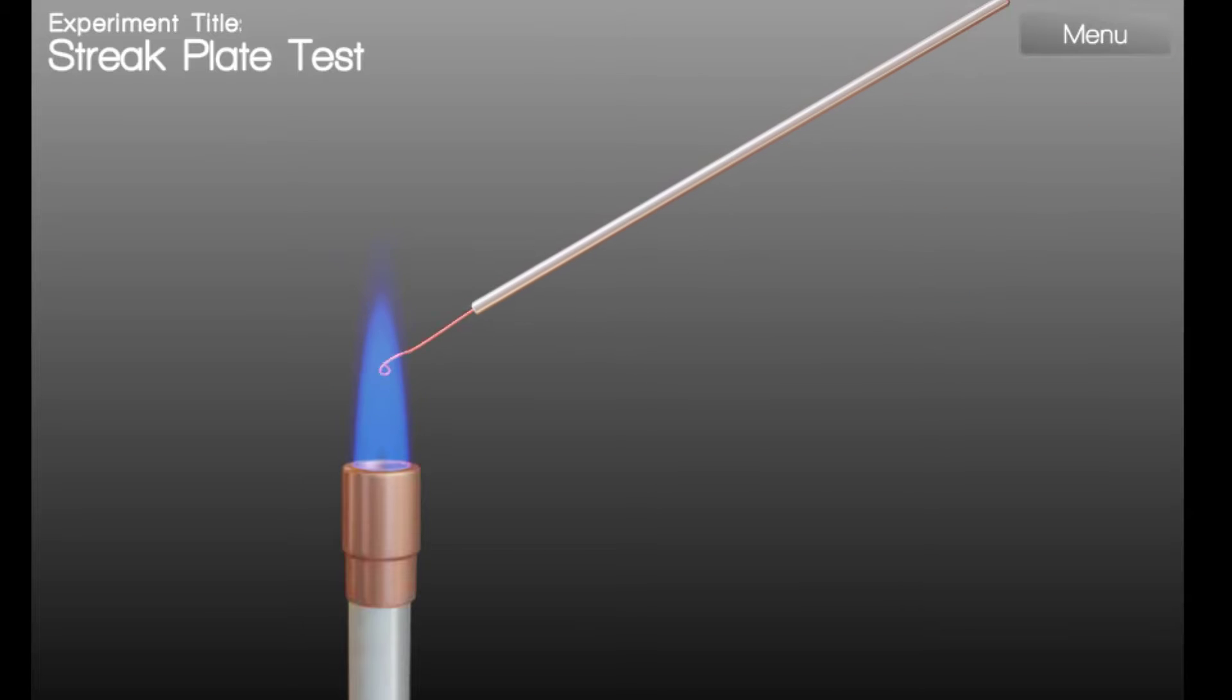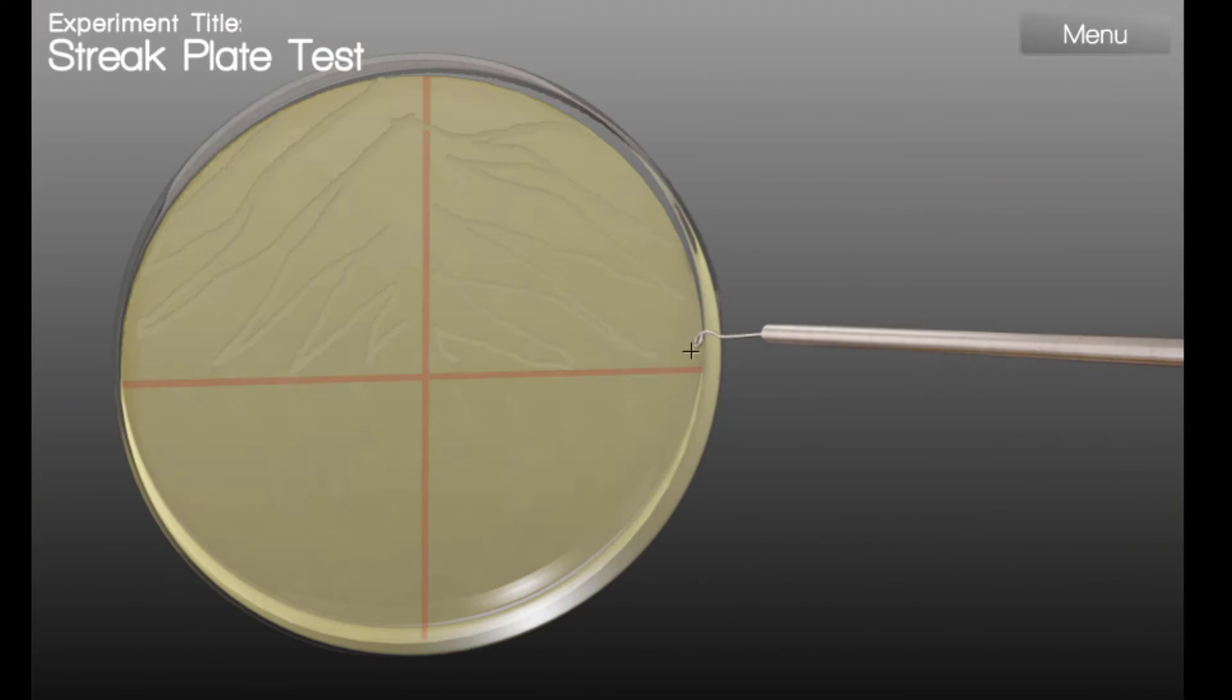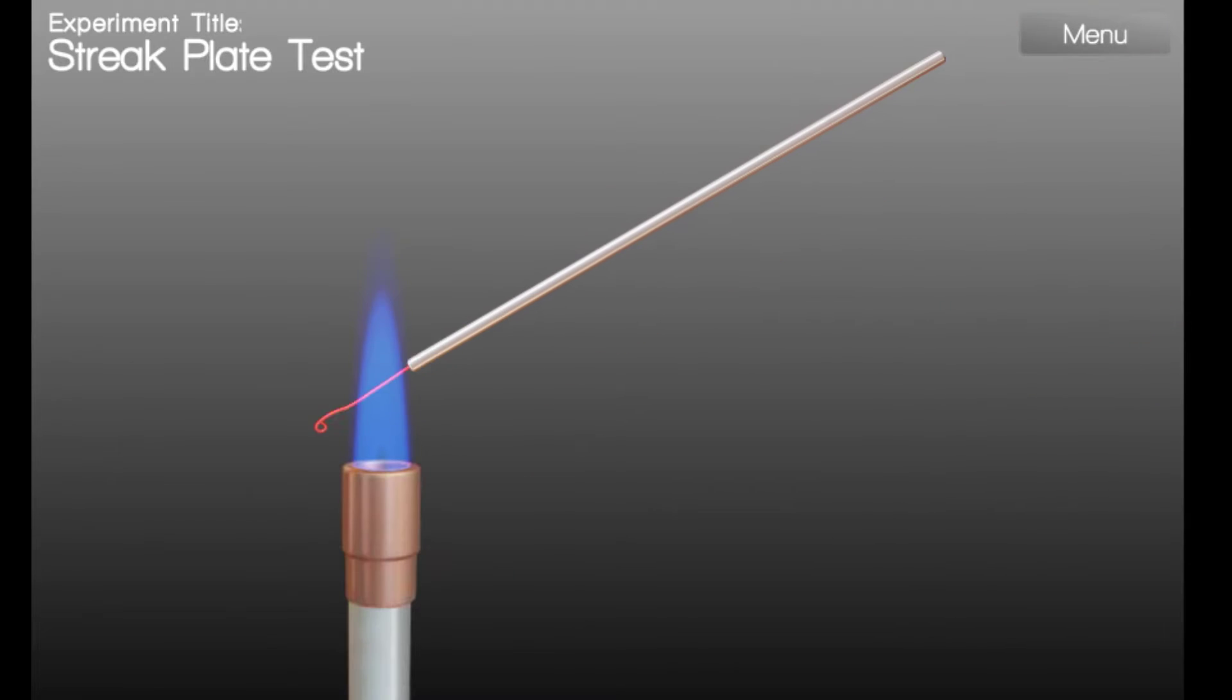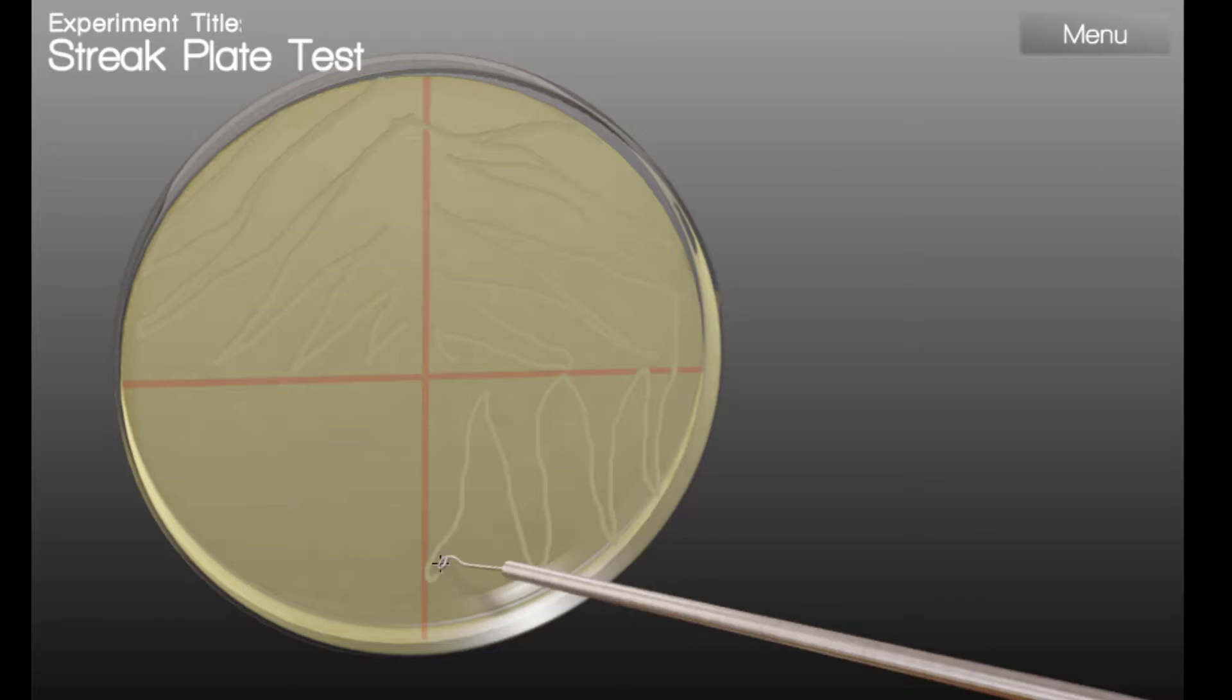Flame and cool the loop again. Turn the plate another 90 degrees and lightly sweep into the third quadrant of the plate. Flame and cool the loop once again. And finally, streak the remainder of the plate.